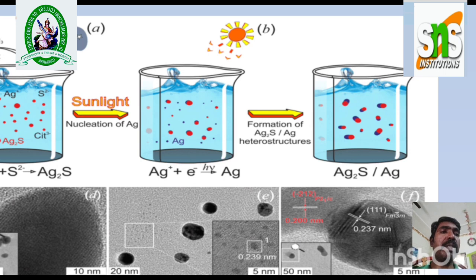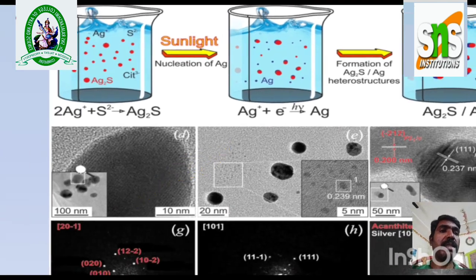Okay, so when we're going to keep a surface, that means a substrate, on the surface of the substrate, the Ag is going to deposit. Okay, so the deposited film, how it looks, how can we get the uniformity and the surface morphology.